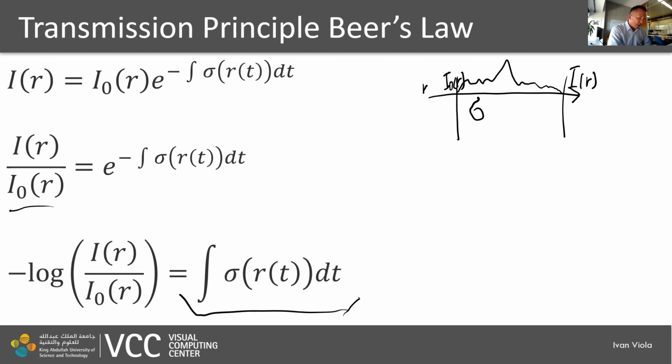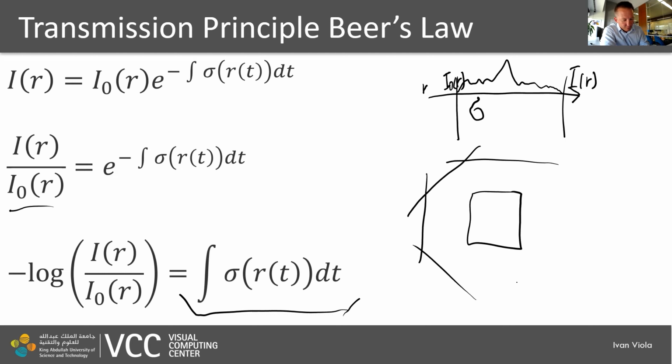In our case, we would have some specimen which we do not know at the beginning, because what we know from the acquisition process are the projections. Imagine that I am drawing it in 2D, from the top view. We have several projections, ideally from several directions, but sometimes this is not possible, like in electron microscopy.